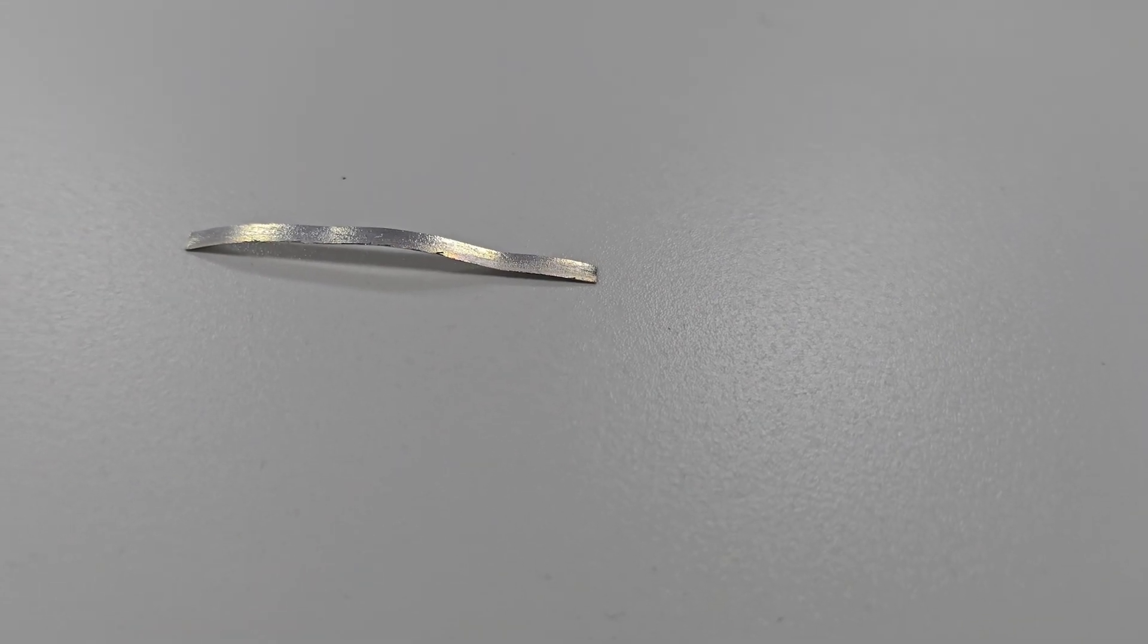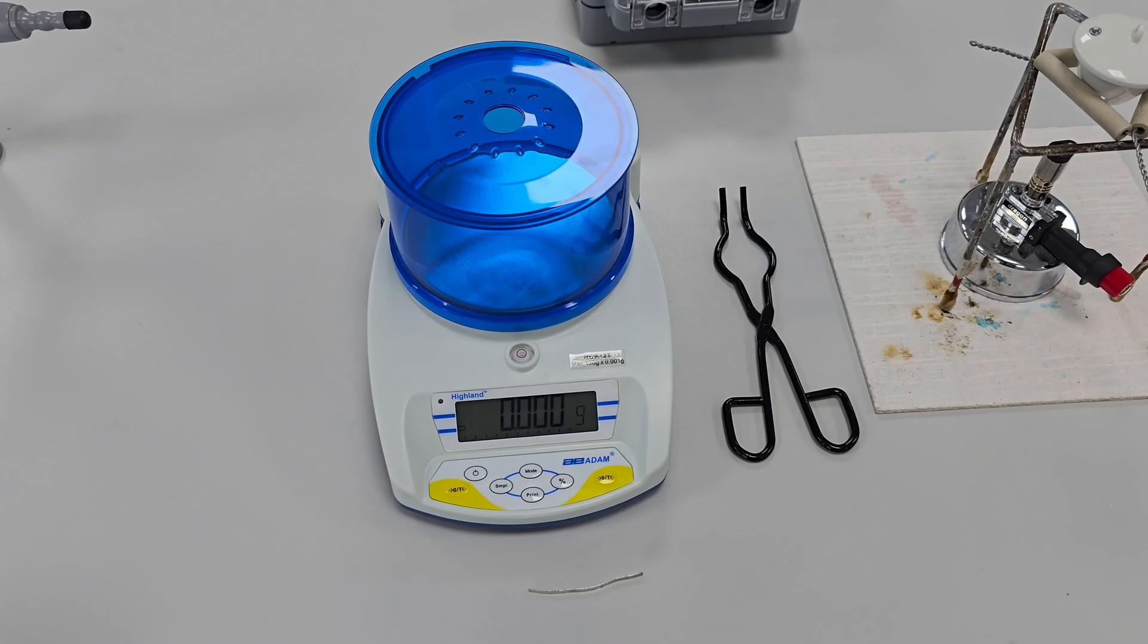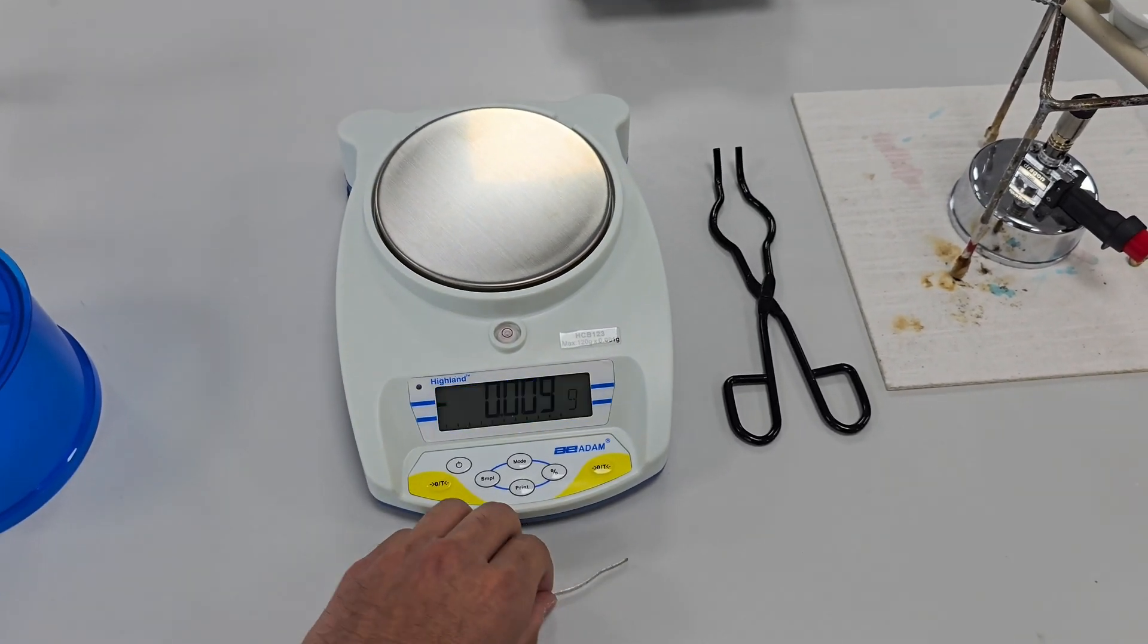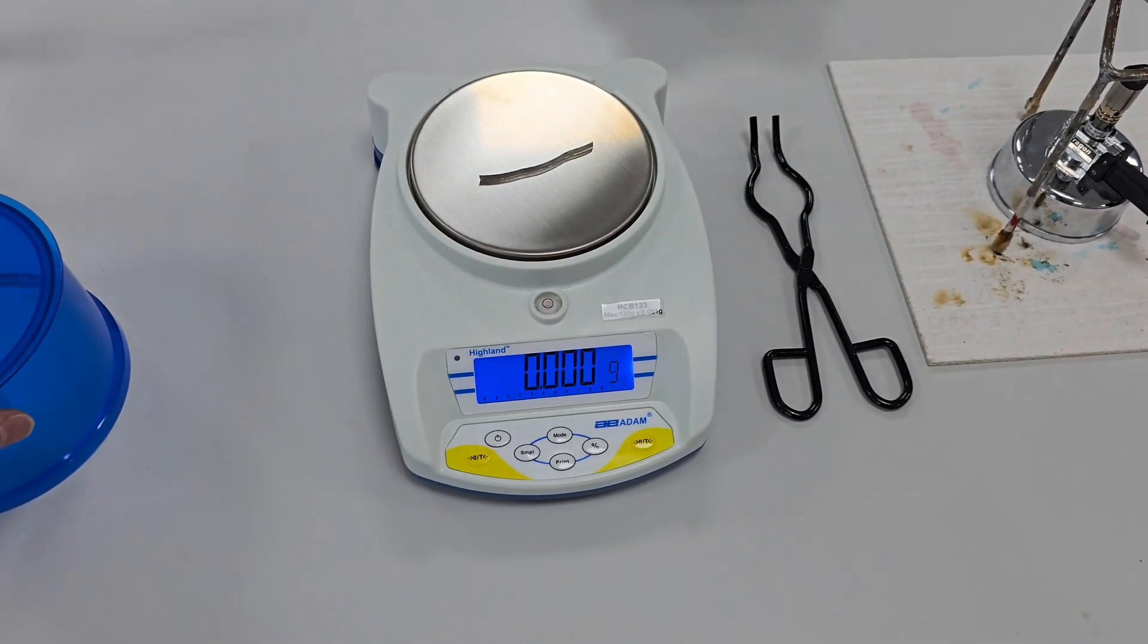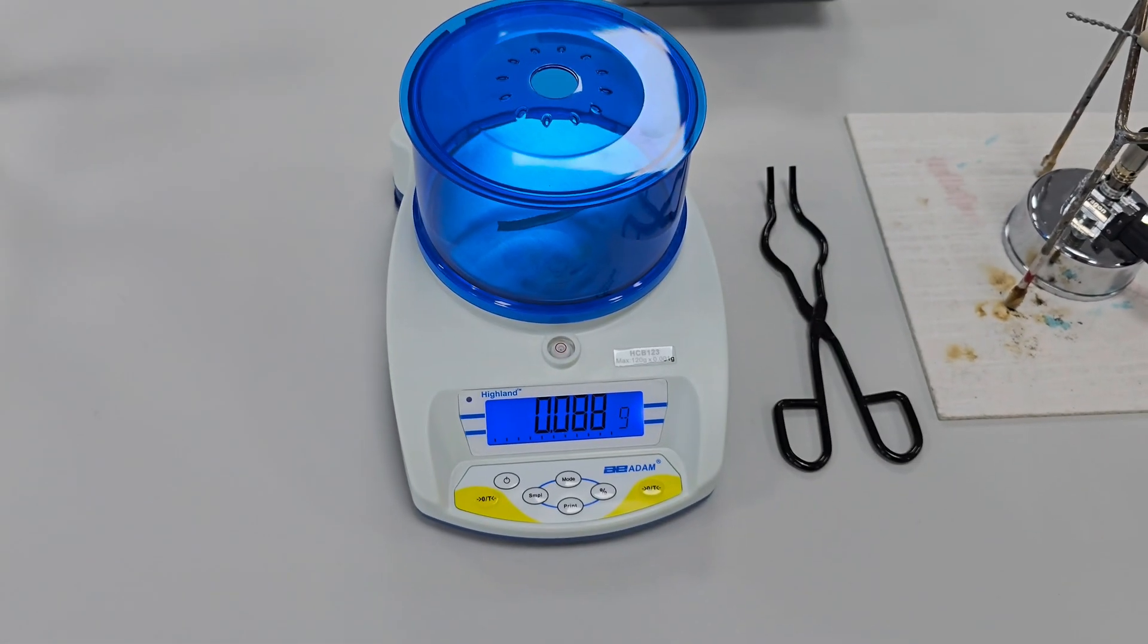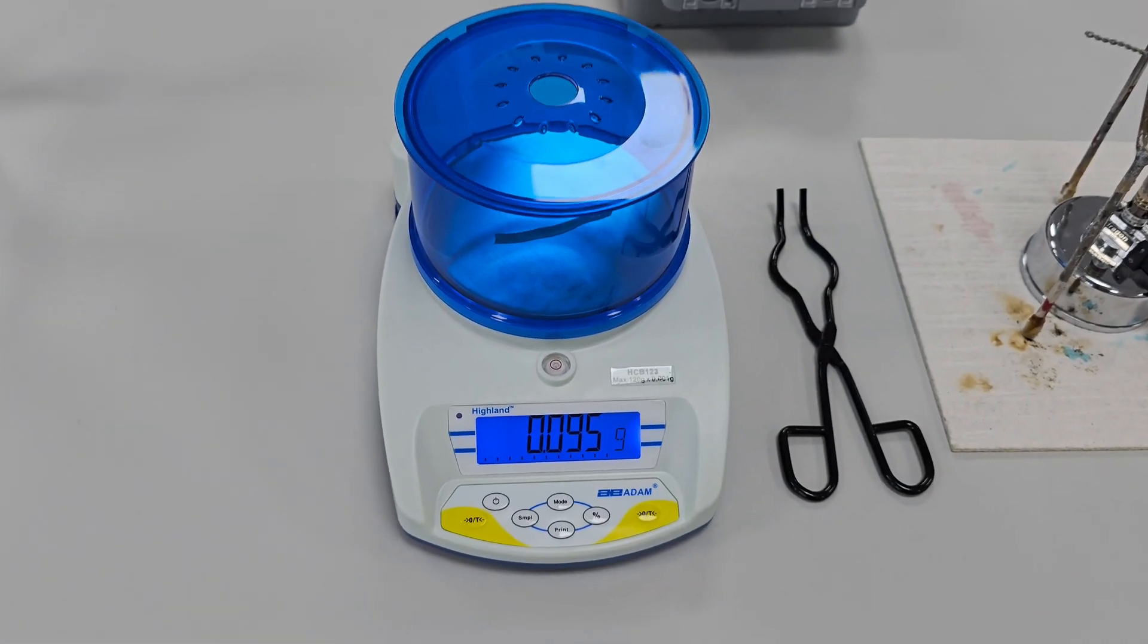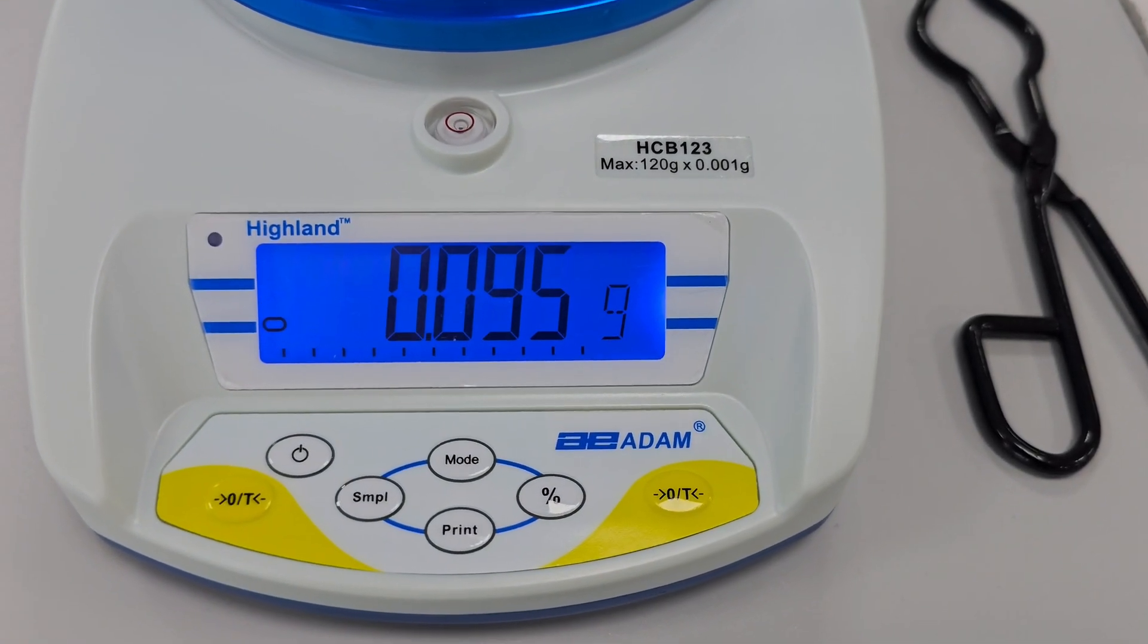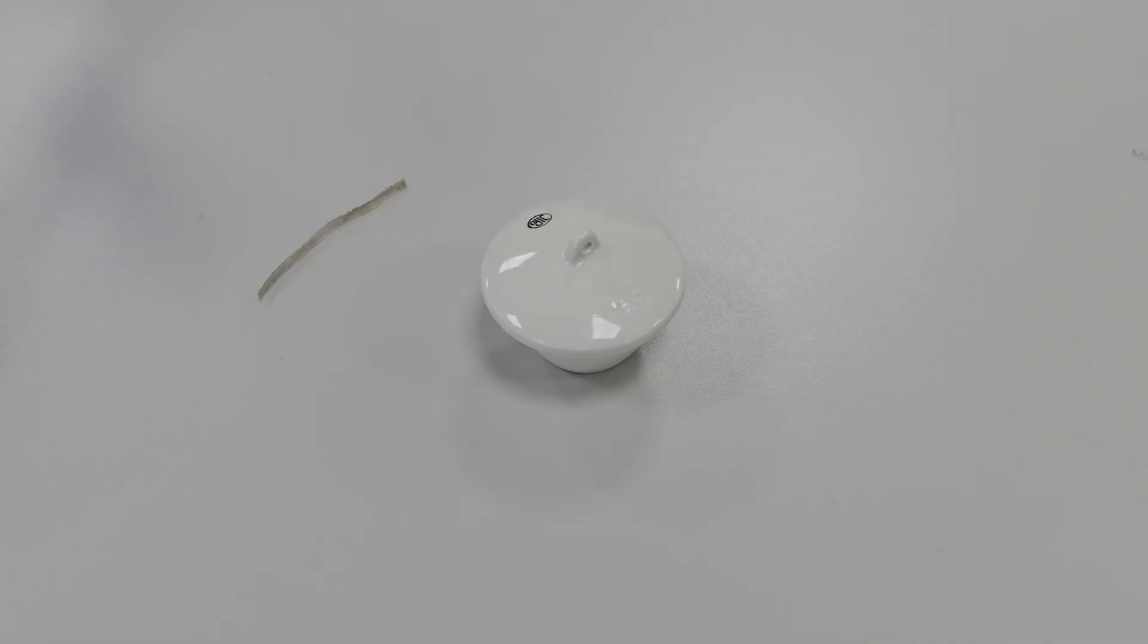Next I'm weighing a six centimeter strip of magnesium ribbon. It comes to 0.095 grams. We'll be heating this magnesium to react with oxygen and form magnesium oxide.